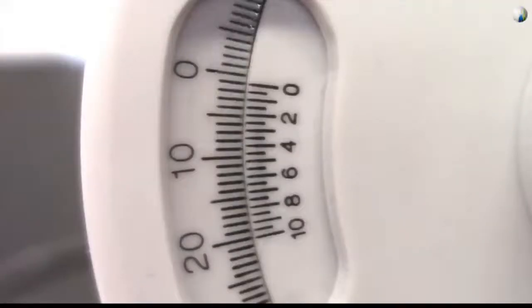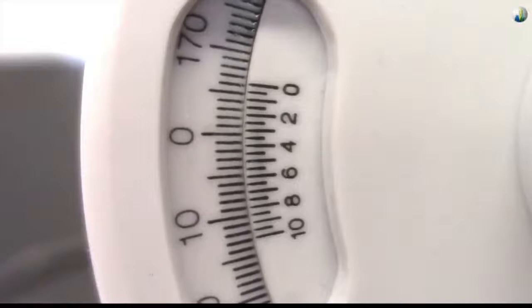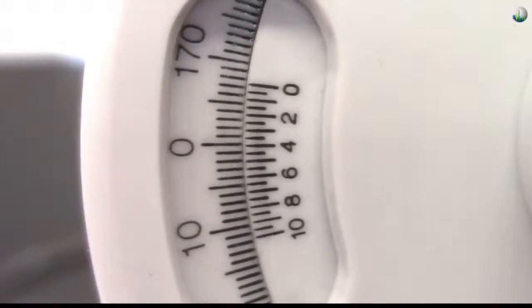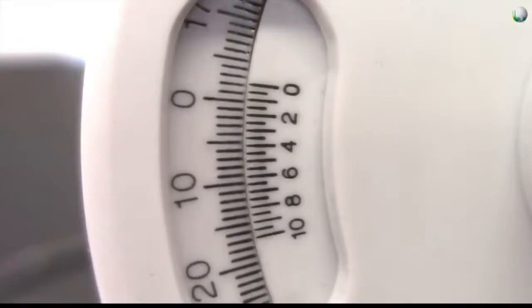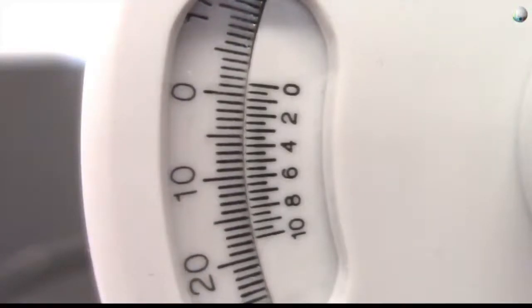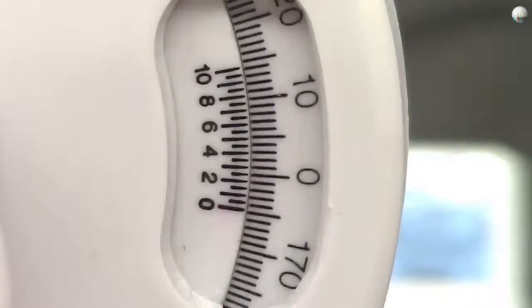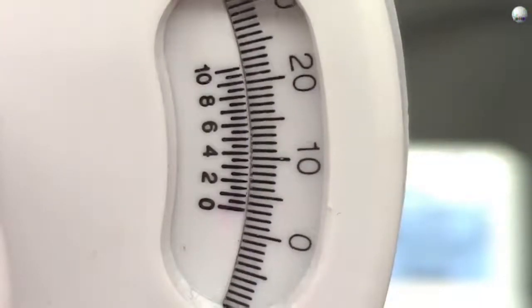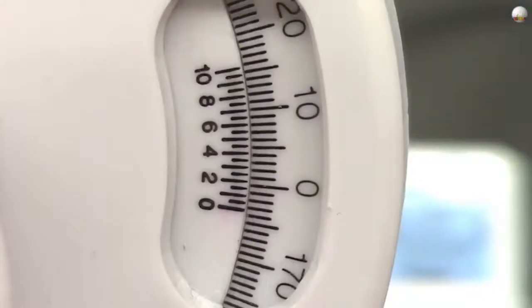If you take the reading on the left side of the machine and the inner scale 0 is above the outer scale 0, then the rotation is negative. And if you take the reading on the right side, then it will be the other way around. Meaning, if the 0 of the inner scale is below the 0 of the outer scale, it is a negative reading.